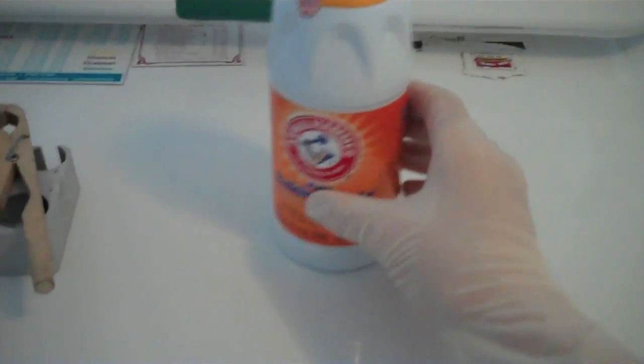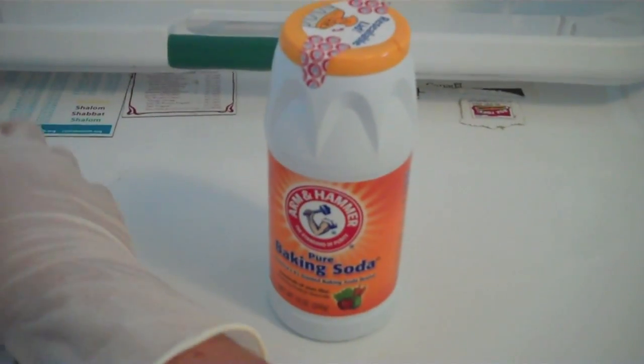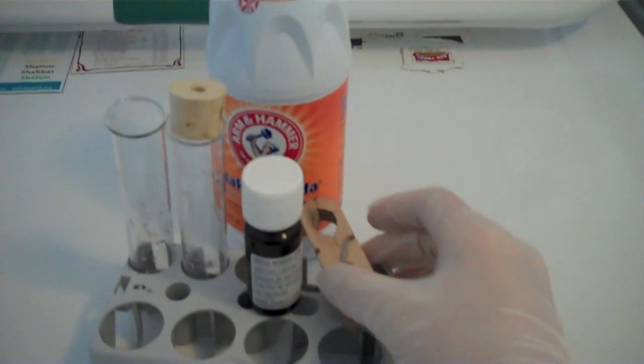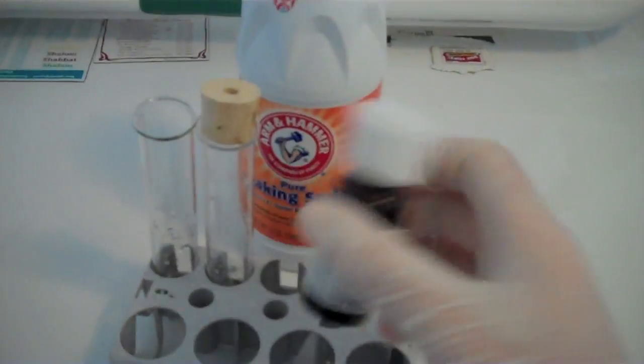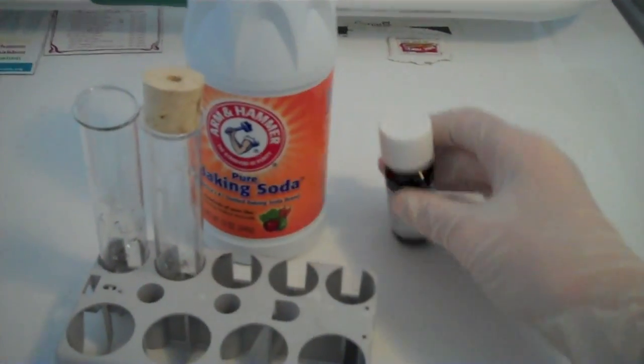Today I will show you how to make sodium carbonate. For this you need sodium hydrogen carbonate, which is baking soda, two test tubes, and optional is some litmus solution.